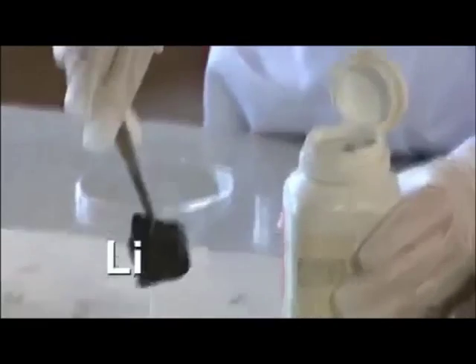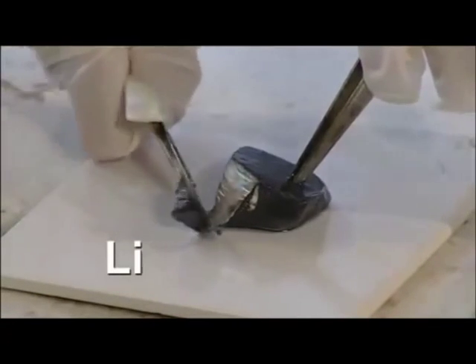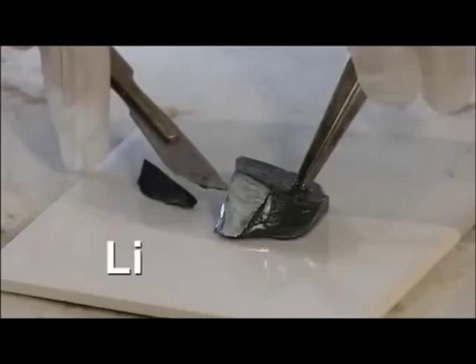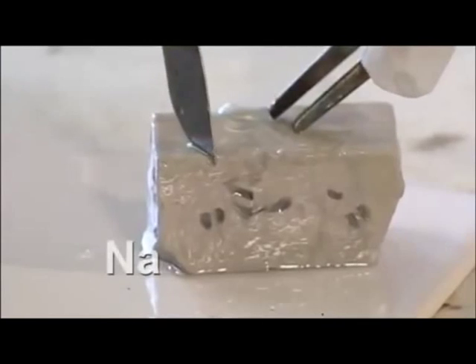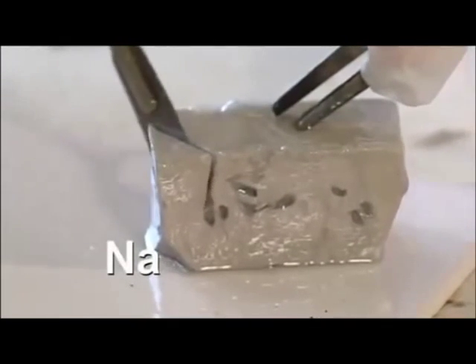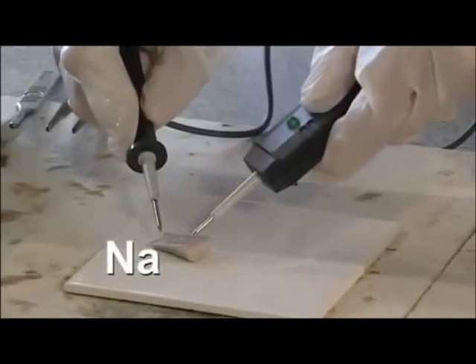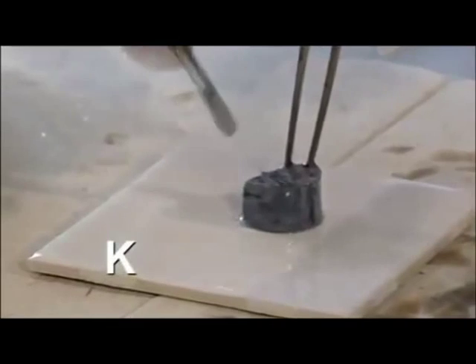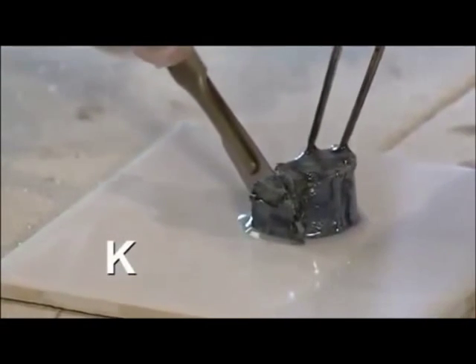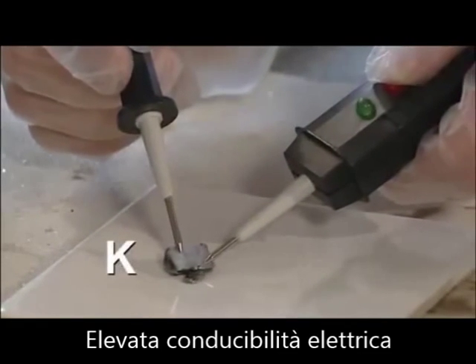Using some tweezers, place on a tile to cut. You can see clearly the shiny silver surface. Over time, we need to cut a piece of sodium off this large piece. You can see the lovely shiny silver surface, showing that it conducts electricity. It's much easier to cut — this is much softer — and there's a shiny silver surface to show clearly that it conducts electricity.